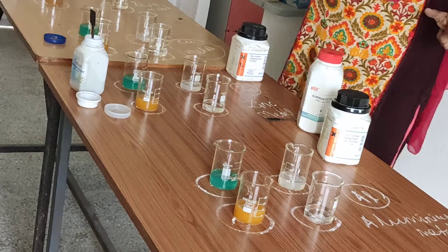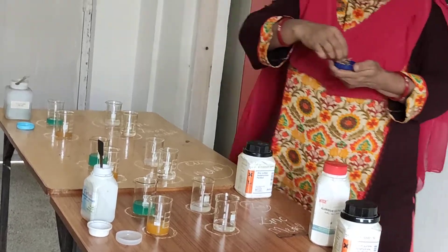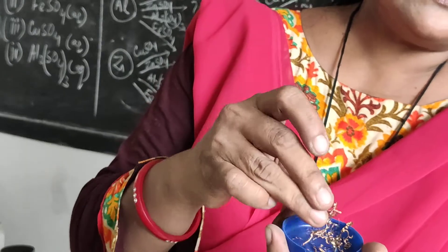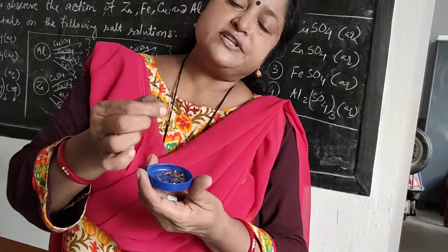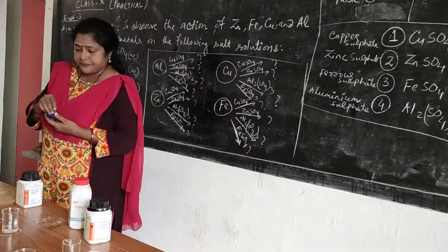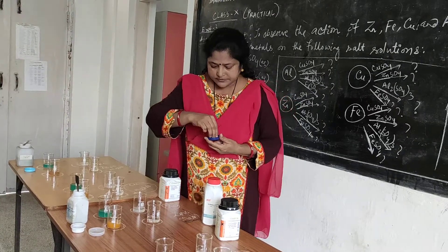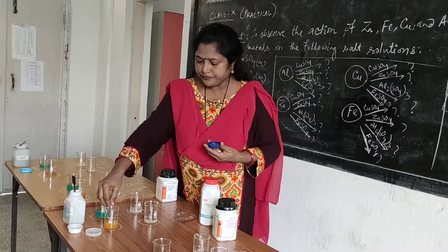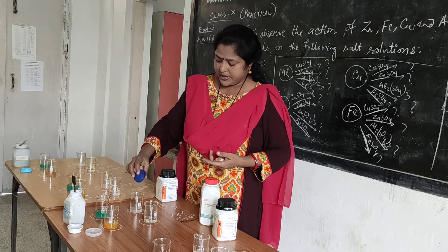For table 2 is copper metal. You want to see copper metal — this is your copper turning, cut pieces from the lathe machine. It is reddish brown and shiny. I am adding copper turnings into all four beakers of table 2: 1, 2, 3, and 4. I have added copper.